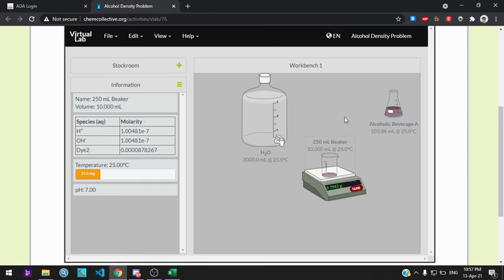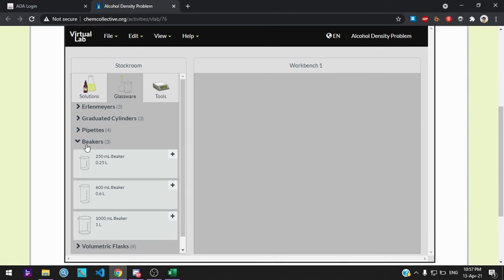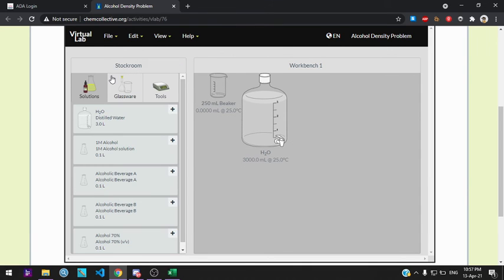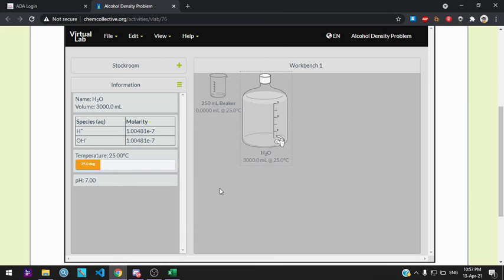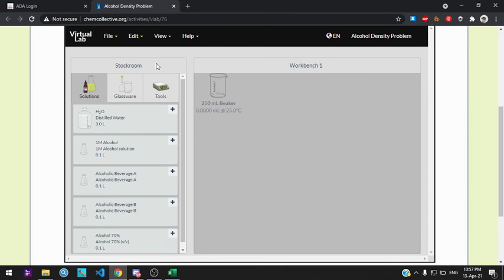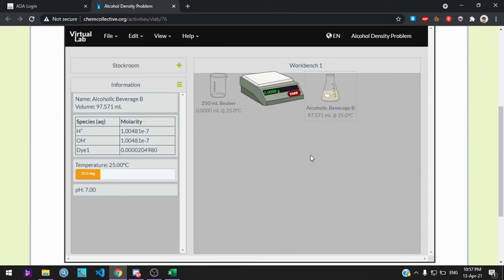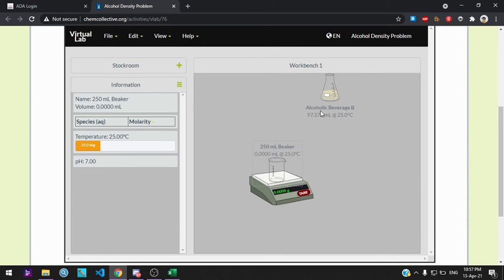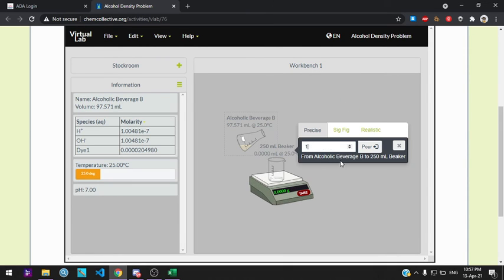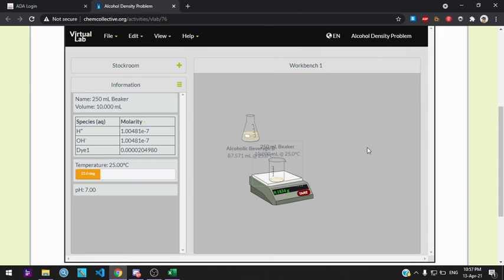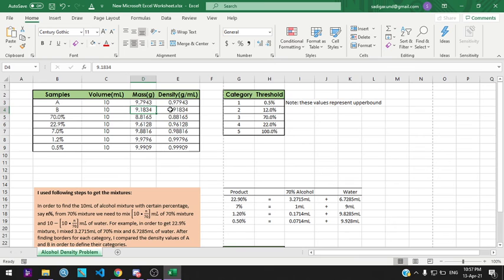Let's calculate the value for beverage B. That will be 9.183 grams. We record that to the data sheet. If we calculate the density, we can see 0.992 approximately.